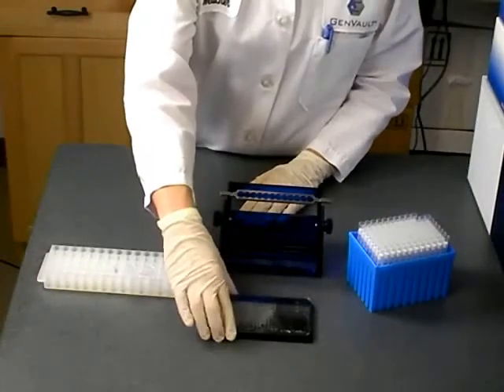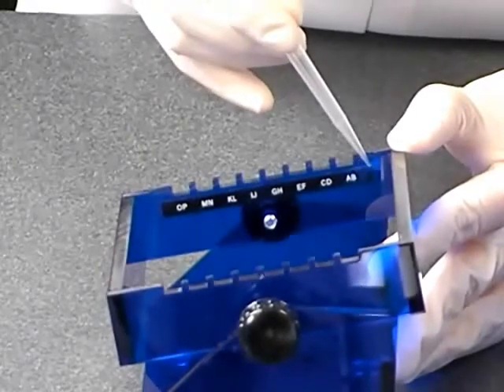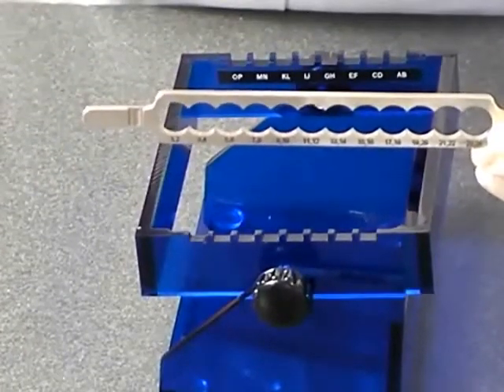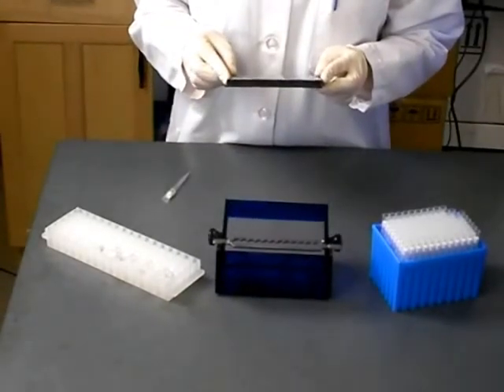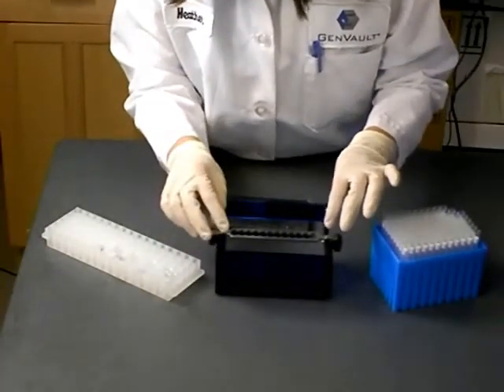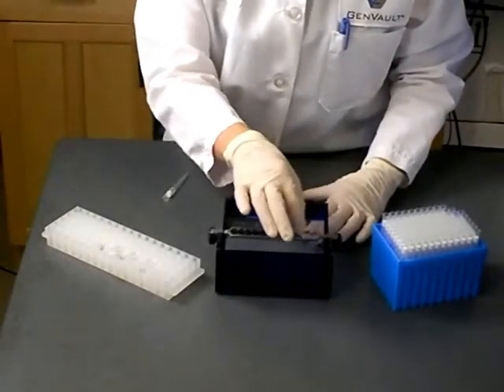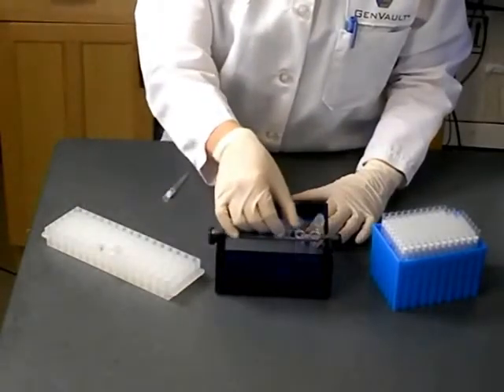Remove the GenPlates from which you wish to recover samples from storage. The Gen Punch is labelled with corresponding row letters A, B, and the aluminum tube holder is labelled with corresponding column numbers 1, 2. Determine the row letter and column number of the GenPlate element that you wish to remove. Position the tube holder in the grooves on the Gen Punch labelled with the row letter, then place a 2ml tube in the tube holder in the position with the corresponding column number. The caps should point toward the middle of the Gen Punch. From this position you can remove 4 GenPlate elements without repositioning your tube holder or tube.